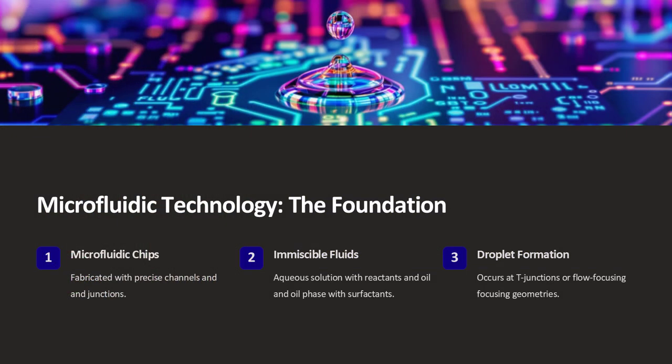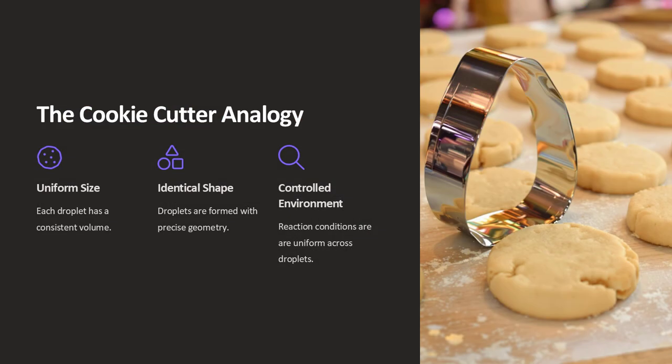By incorporating microdroplet technology, researchers can miniaturize and parallelize these reactions, creating thousands or even millions of tiny reaction vessels, each a microdroplet, that serve as independent laboratories. This approach dramatically increases throughput, reduces reagent consumption, and allows for more precise control over reaction conditions.